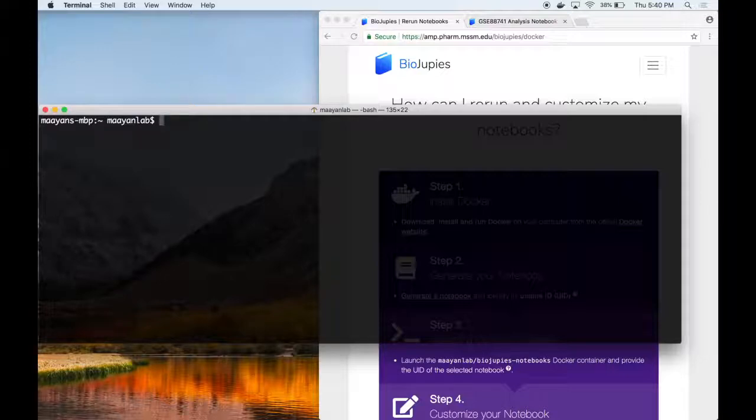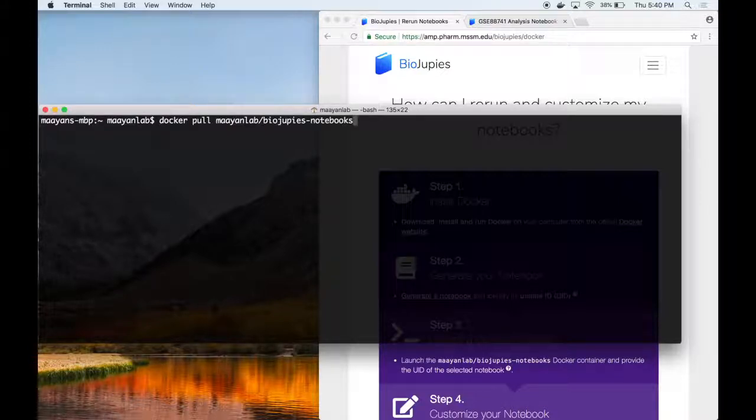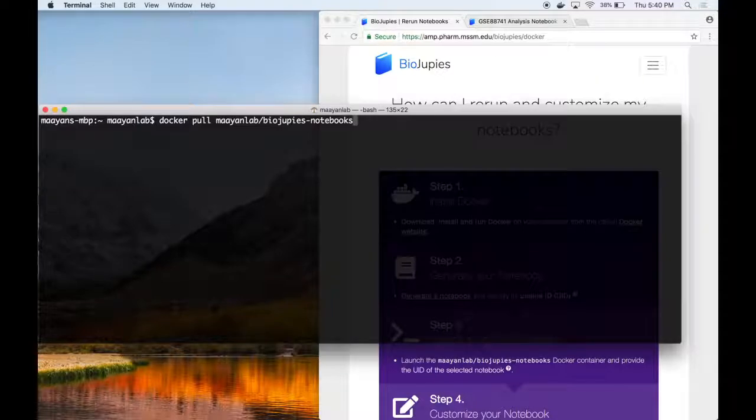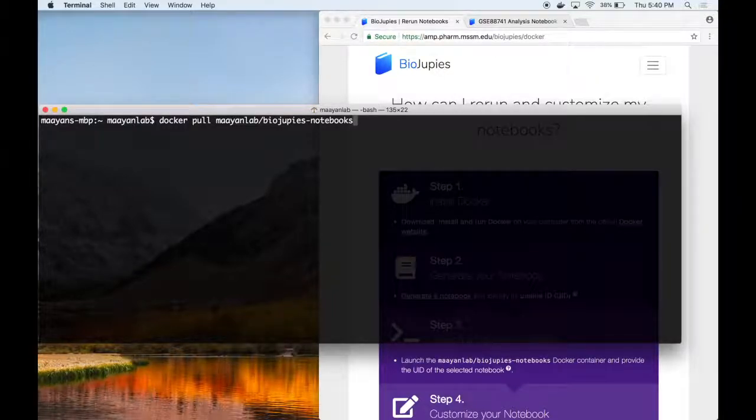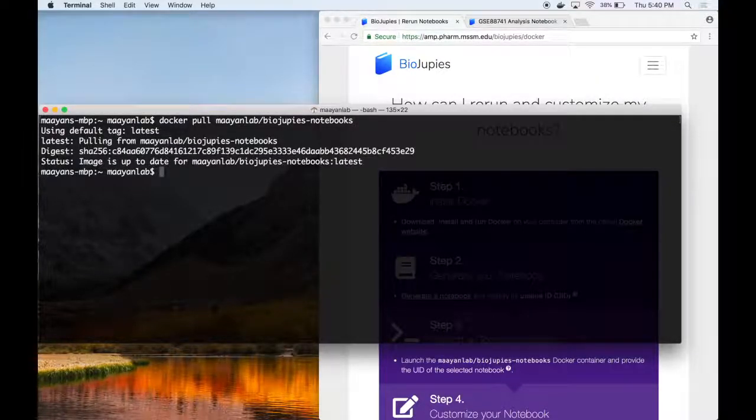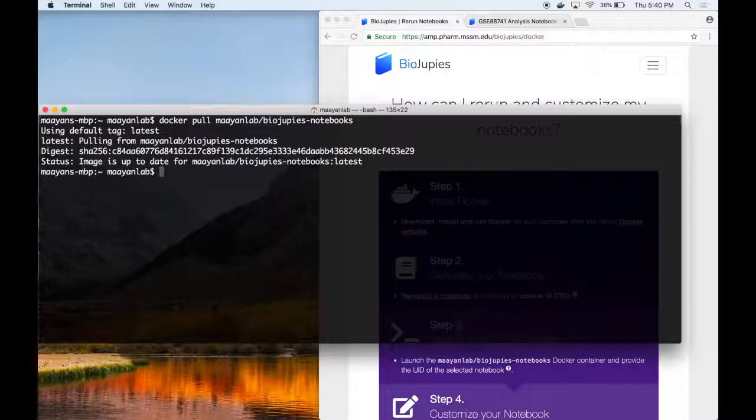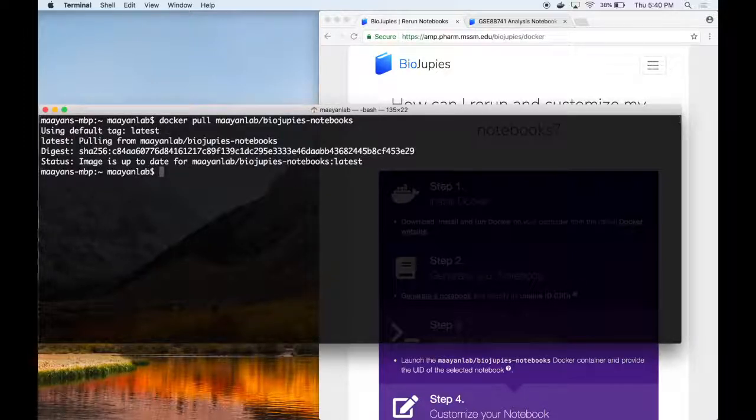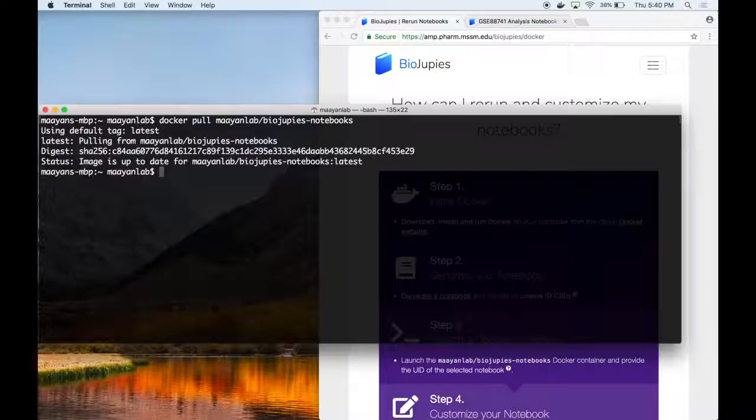First, we recommend entering the docker pull mayan lab slash biojupes notebooks command. This will pull the latest version of the Docker container with the most updated version of the BioJupees RNA-seq data analysis library. The process might take several minutes. In our case, the latest version of the container has already been downloaded.